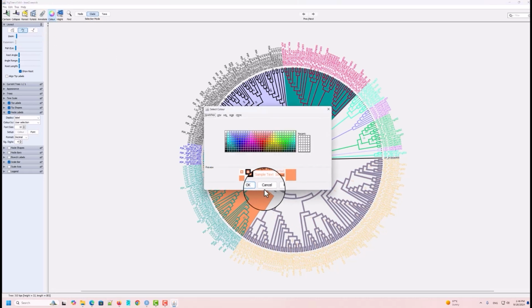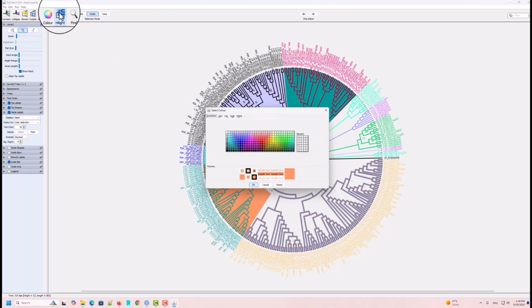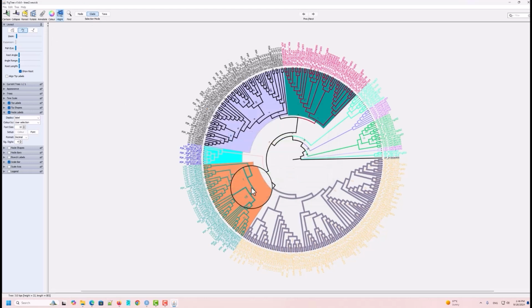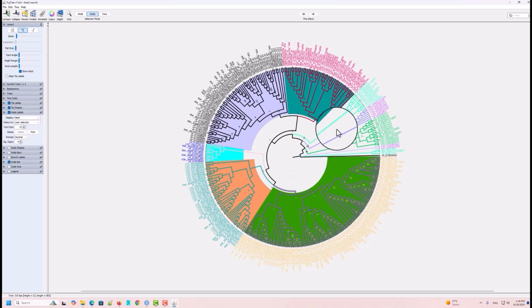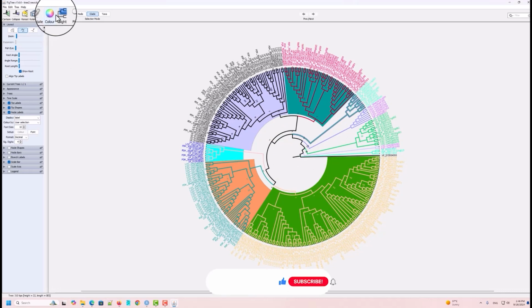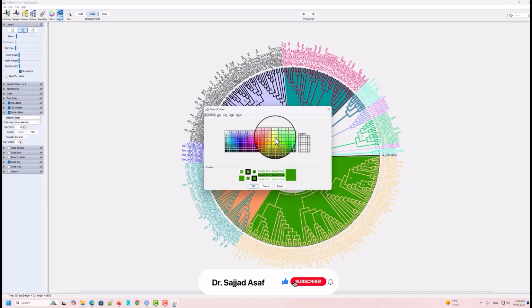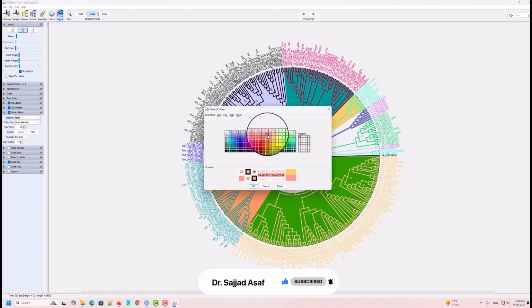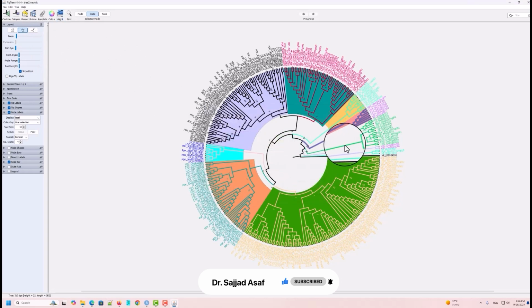Sorry, not this one. You have to click this Highlight. Here you can give any color of your choice. Okay.